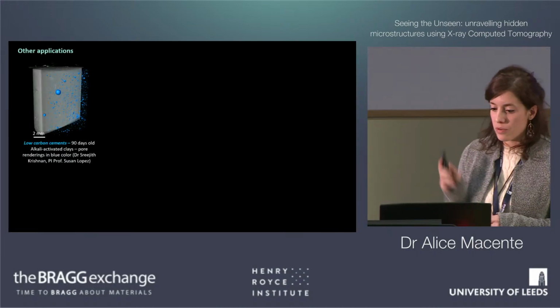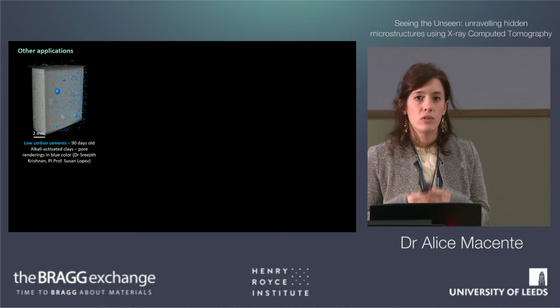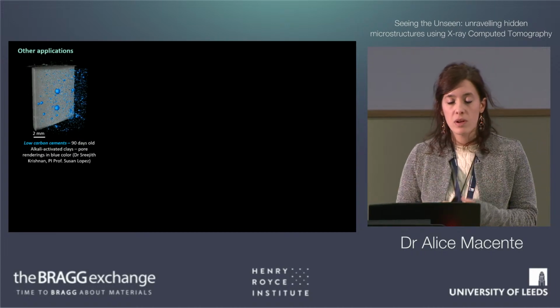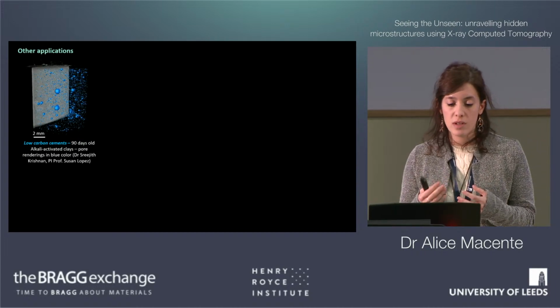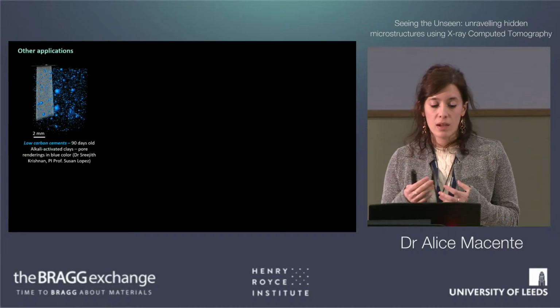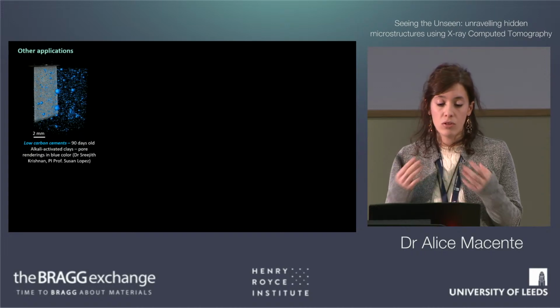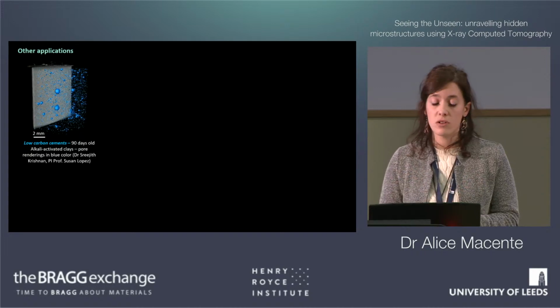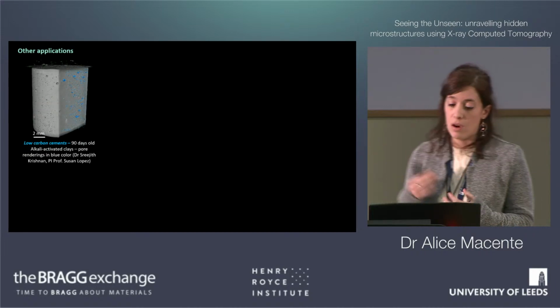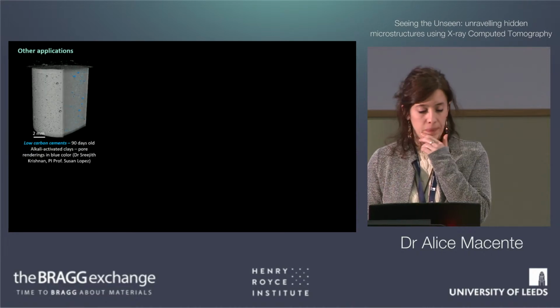In the research group I'm currently part of, we use XCT to monitor the evolution of microstructures in low-carbon cement. And we do this because we are trying to assess how different types of cements with low carbon, how the pore structures actually control their mechanical strength. So it's really quite important that we monitor this over time for durability and sustainability.